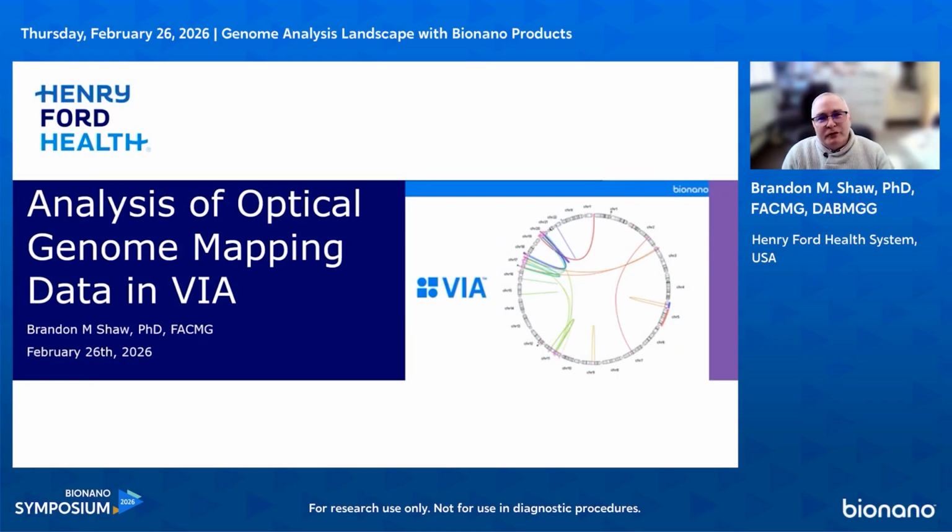So, hi, my name is Brandon Shaw, and I'm the Clinical Cytogenetics Director at Henry Ford Health System. And today I will be talking to you about the analysis of optical genome mapping data in VIA.